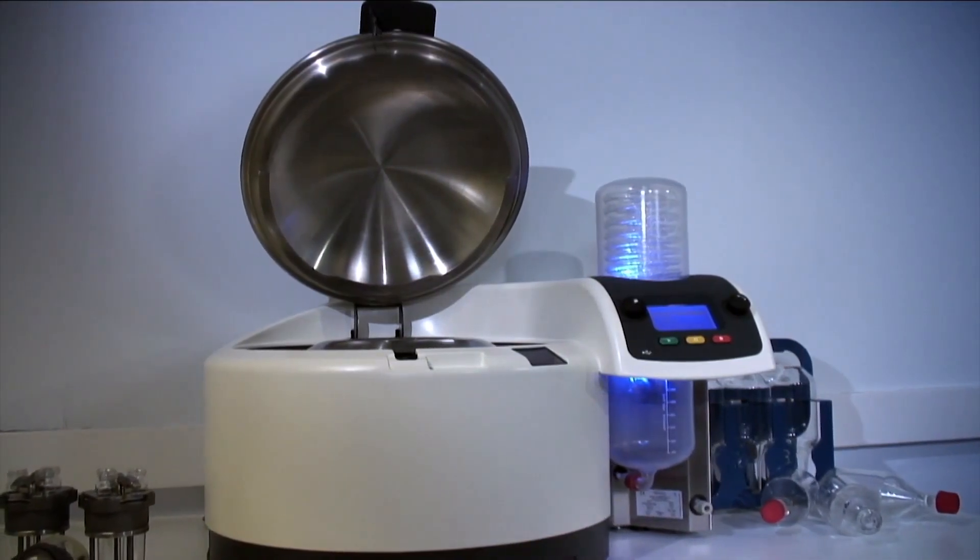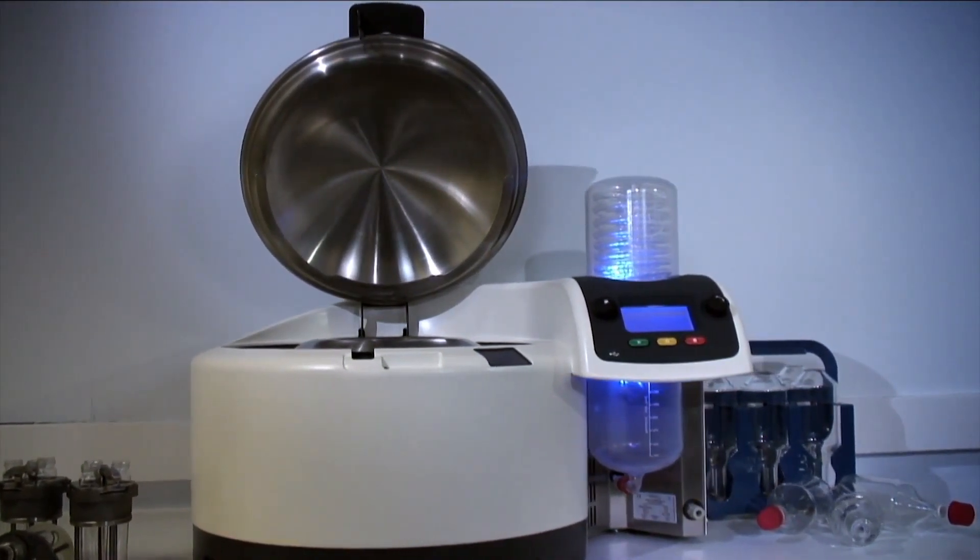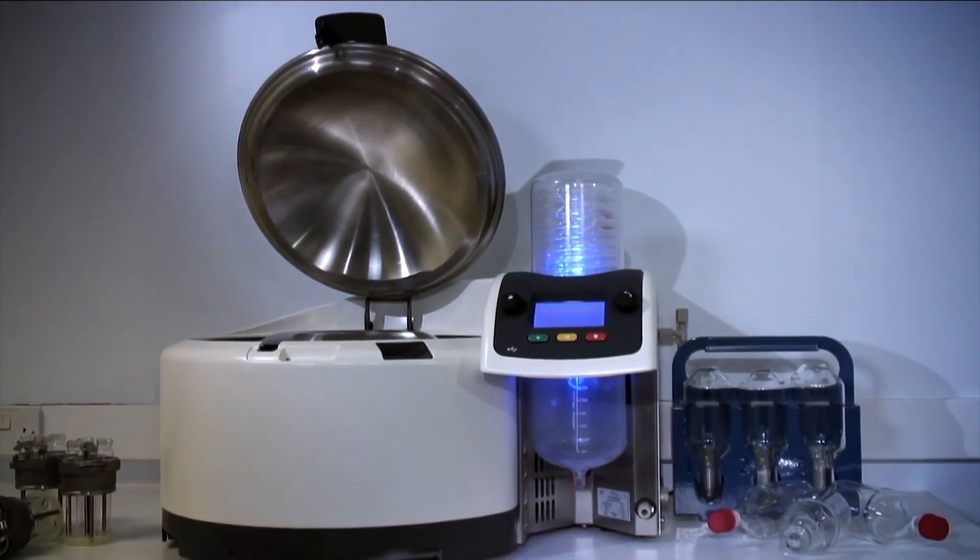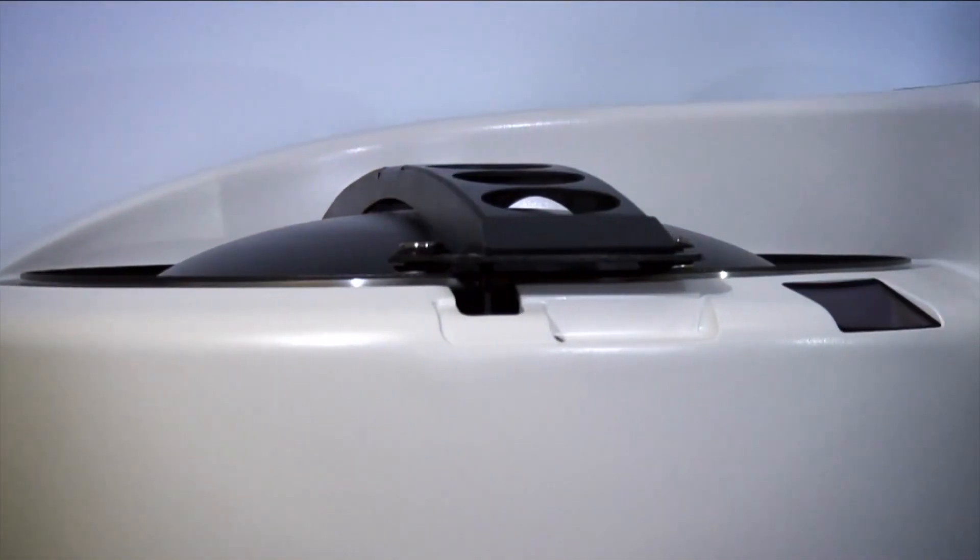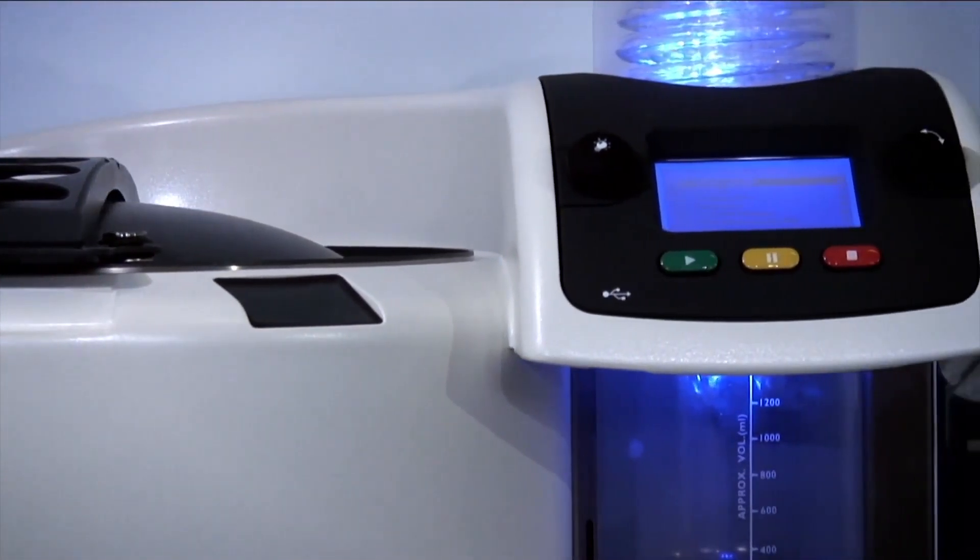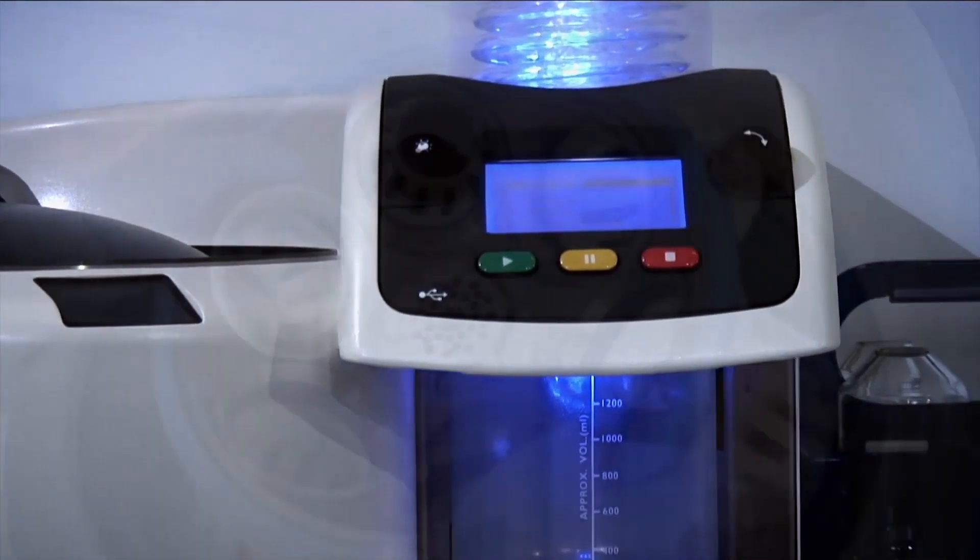The rocket is a unique high-speed evaporation system specifically for the evaporation and concentration of large volumes of solvent. The speed and functionality of the rocket evaporator and its accessories provide significant work savings in the laboratory.